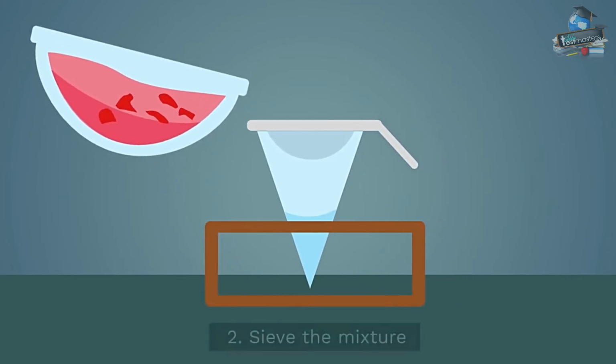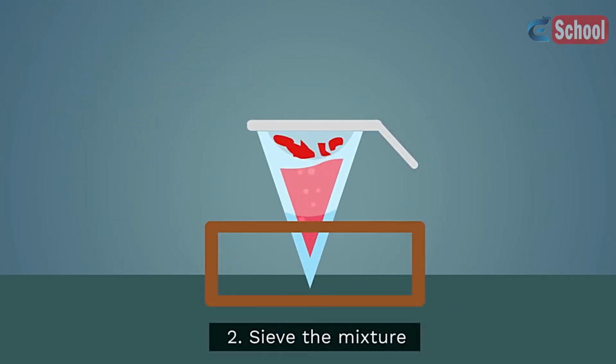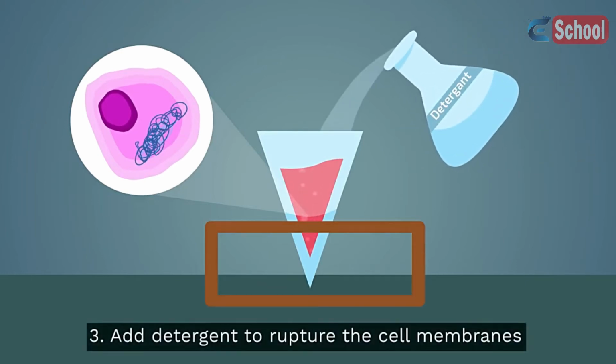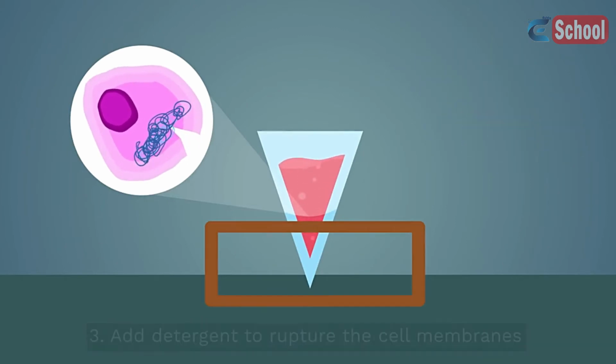The next stage is to pass the liquid through a sieve and collect the fruit soup. This will contain all the strawberry cells with the DNA inside the nucleus. To break apart the membranes surrounding the cell and the nucleus and release the DNA, you add some detergent, such as washing up liquid, to the soup. This ruptures the cell membranes.